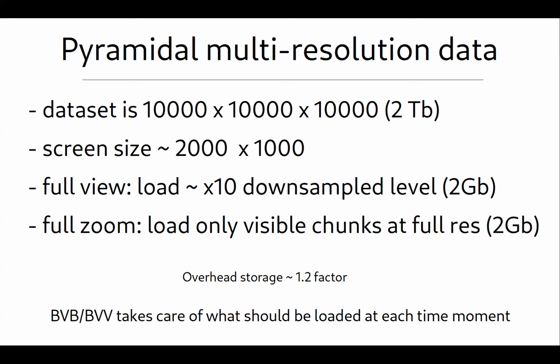Storing the data in this format usually requires a little bit of overhead, but it's actually not that much. For example, if you have 2 terabytes and store it in this format, you will have 20% more. But the user experience of browsing becomes really smooth.